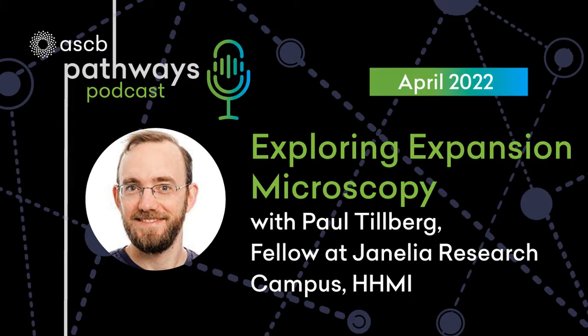So I think that the main thing that we need for the democratization to reach its full potential is to figure out how do we really get reliably good staining with very high signal, and not have to choose our favorite structures of interest that people love to demonstrate technologies like microtubules. If you want to look at your protein of interest, are you going to be able to stain for it intensely enough that you're still going to find it after this 100-fold signal loss?